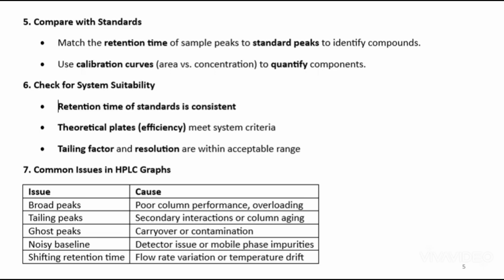Use calibration curves like area versus concentration to quantify the compounds. Check for system suitability. Retention time of standard is consistent. Theoretical plates give you an idea about efficiency and meet the system criteria. Tailing factor and resolution are within the acceptable ranges.